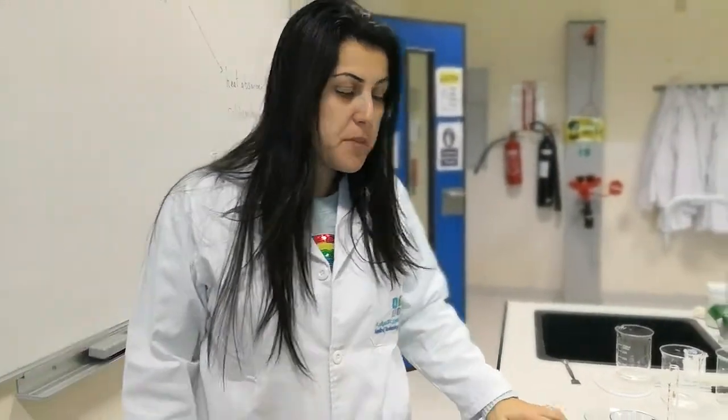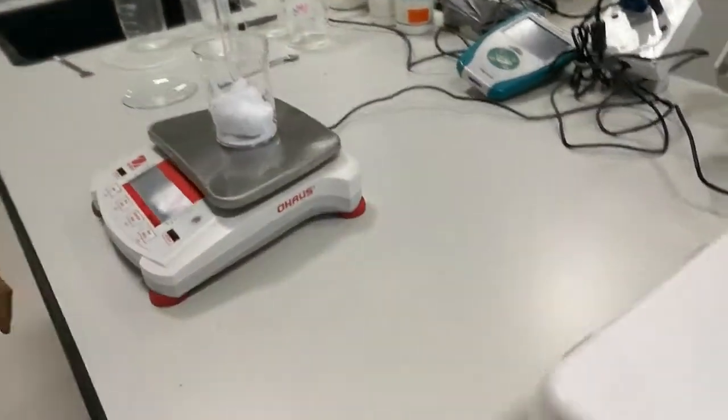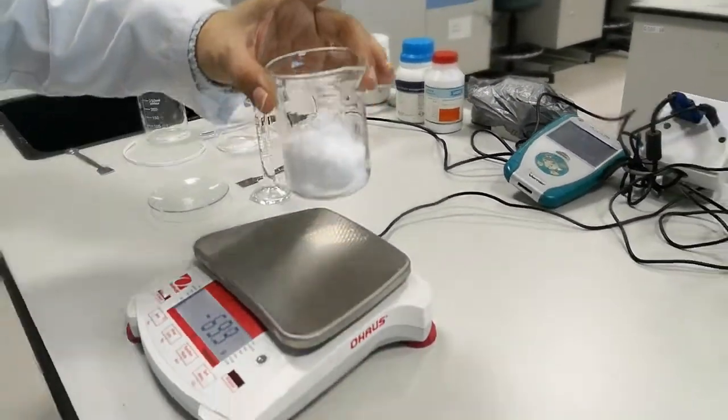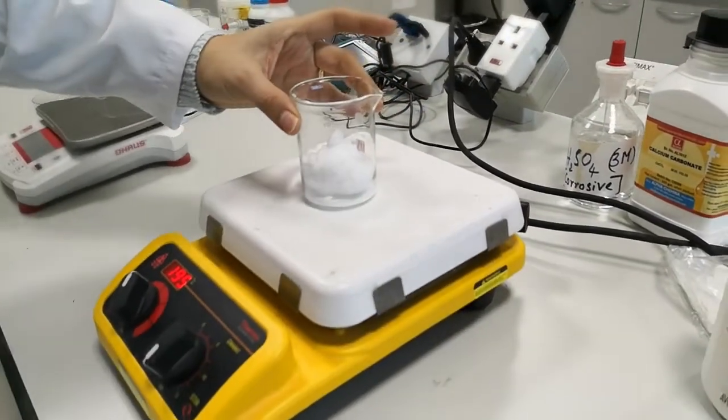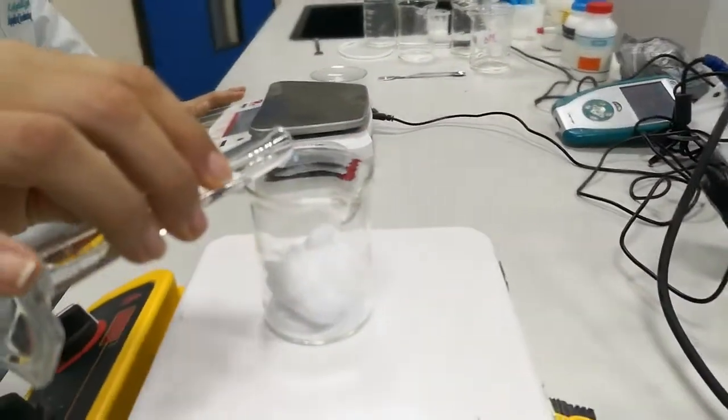This is the experiment of the formation of crystals using sodium acetate. I have here measured around 50 grams of sodium acetate. I am going to put it on a hot plate and add approximately 5 milliliters of water.